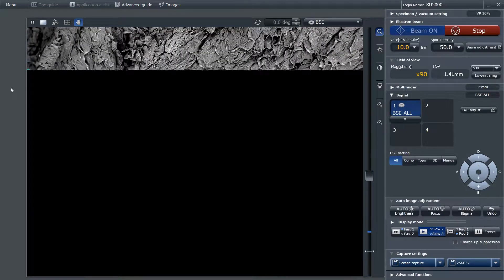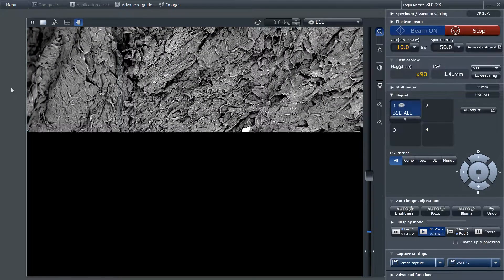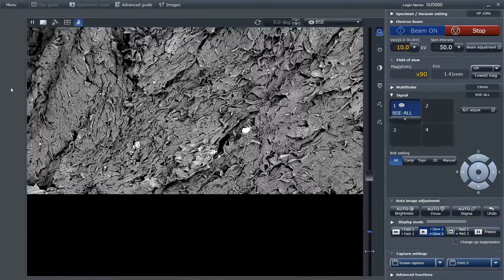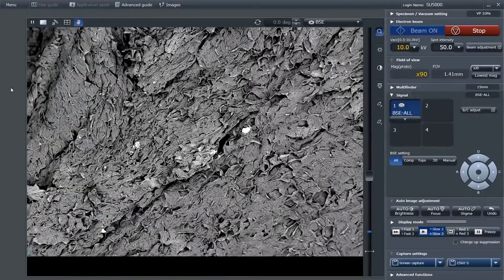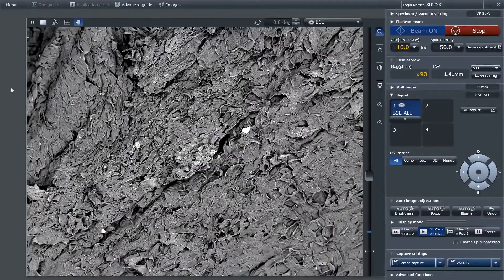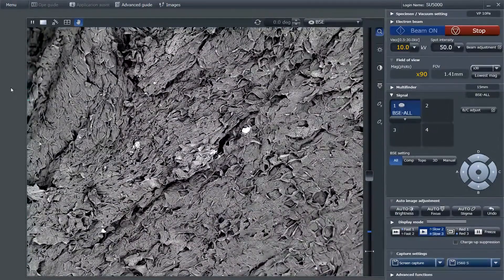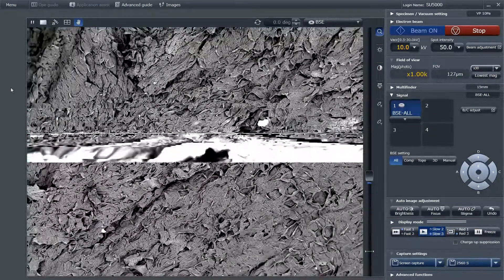Now I've changed my detection mode so that we get a different kind of image of the same area. This image detects the electrons that are scattered back off of the sample.